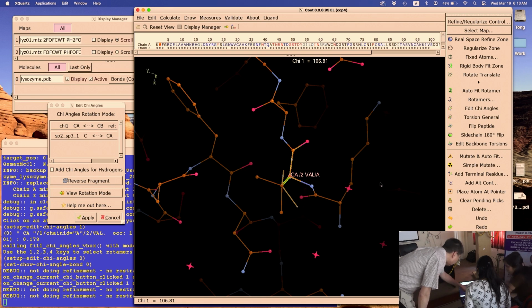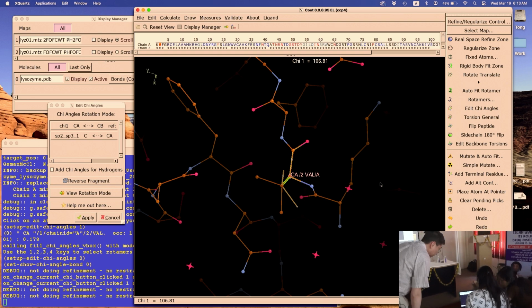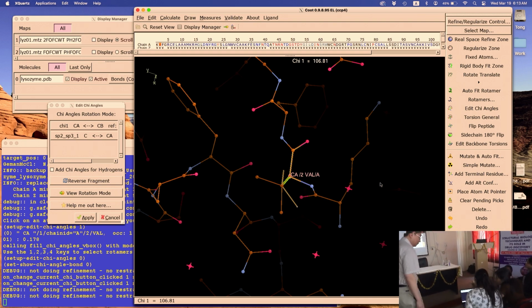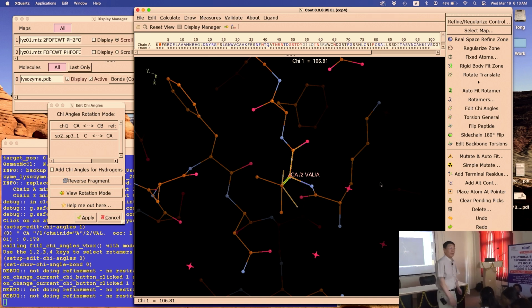So it's the wrong button. Oh, there you go. So now you can drag your left mouse. Yeah, drag. There you go. It's turning. Drag around more. There you go. Yeah, a mouse will be much better.